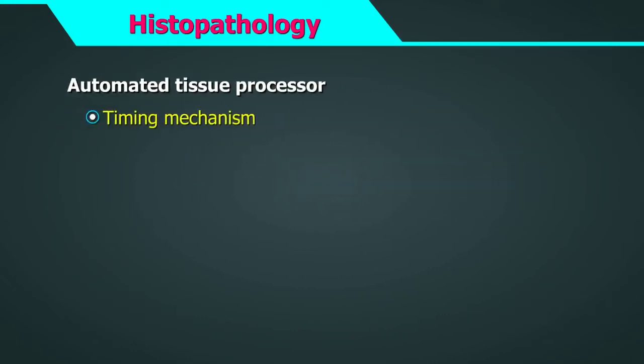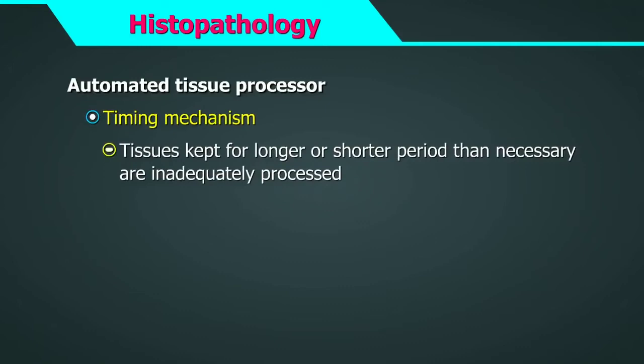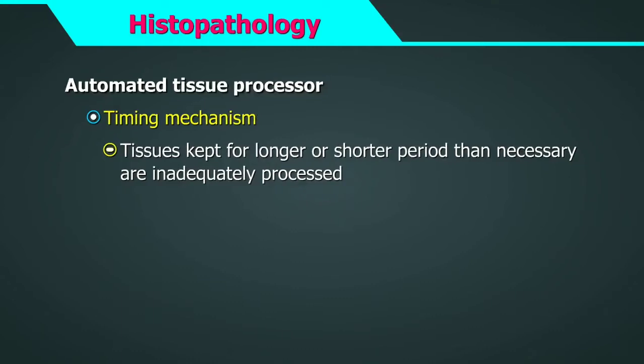Timing mechanism. The timer is meant to keep the tissue in different reagents and wax for an optimum time. If kept for a longer or shorter period than necessary, the tissue will not be adequately processed.